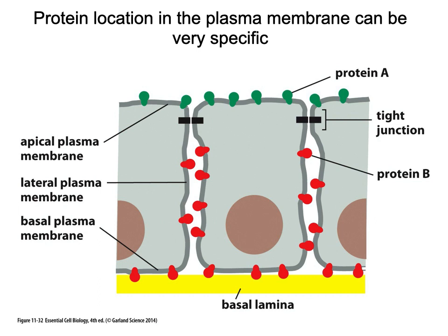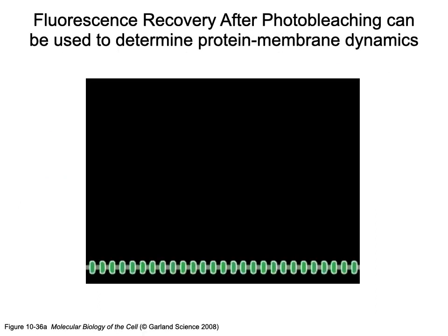Again, we could photobleach a specific area. If we were interested in protein A here, we could photobleach the apical edge, and it would allow us to look at the recovery of protein A. Where if we know the protein we're interested in is protein B and it's found in the basal plasma membrane, we could photobleach that area and look at recovery for that. The lateral mobility of membrane proteins: I'll put that video up.